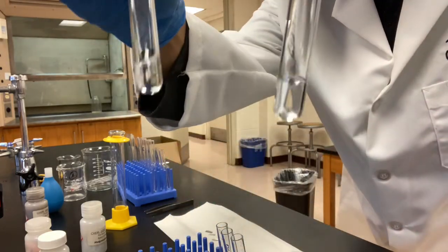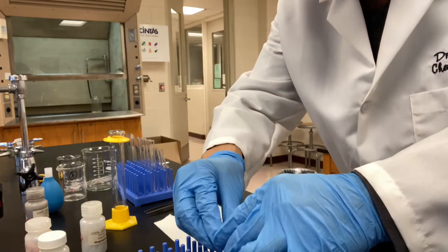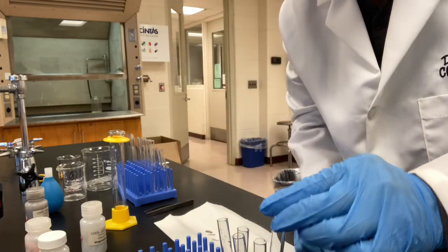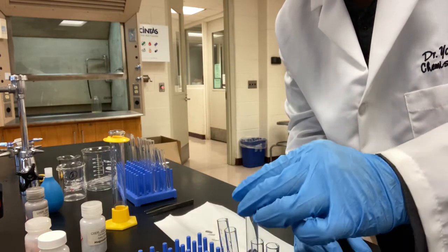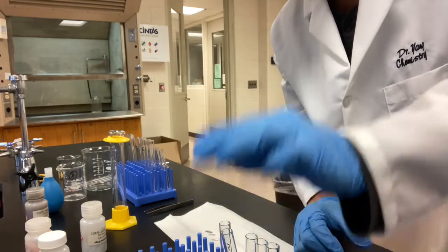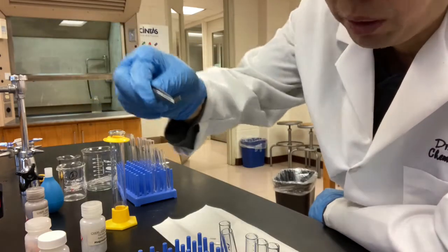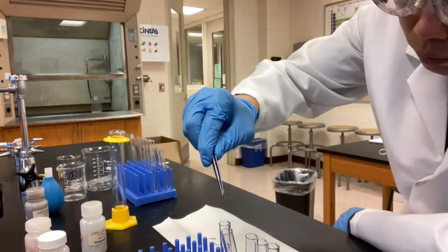Now I have 5 test tubes. Each one has 1 ml of the corresponding acid. So starting from the first one: sulfuric acid, hydrochloric acid, nitric acid, phosphoric acid, and acetic acid. Now I'm going to add a piece of magnesium ribbon to each one of them, and I'm going to show you the reaction rate. We'll watch them together.